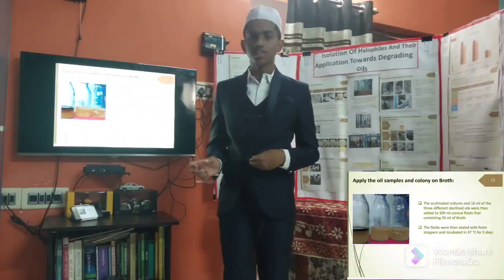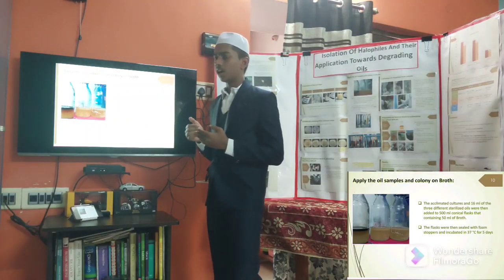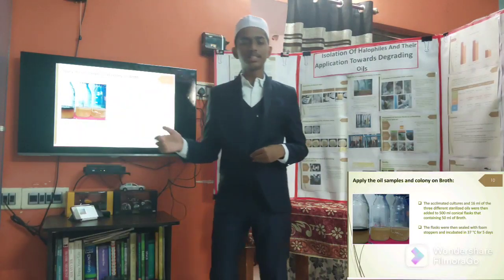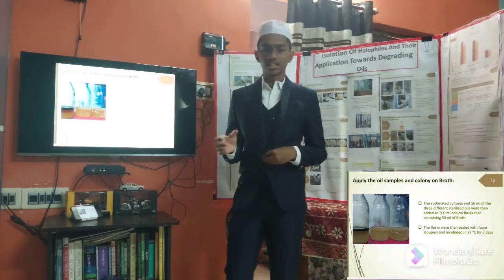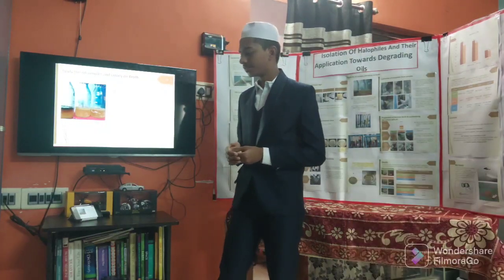And the last stage of the project is to apply the oil samples and colony on broth. After the incubation of these acclimatized cultures, we are going to add 16 ml of oil and 50 ml of broth into that culture. And we are going to incubate it for 5 days for the bacteria to act on the oil.